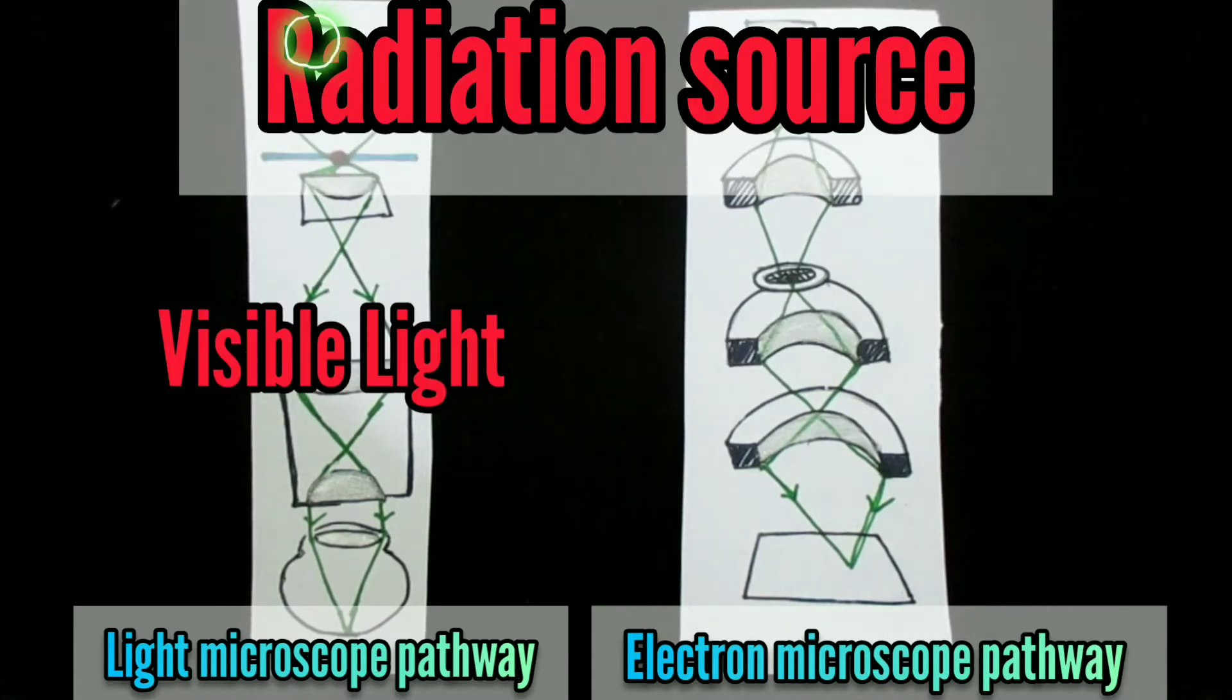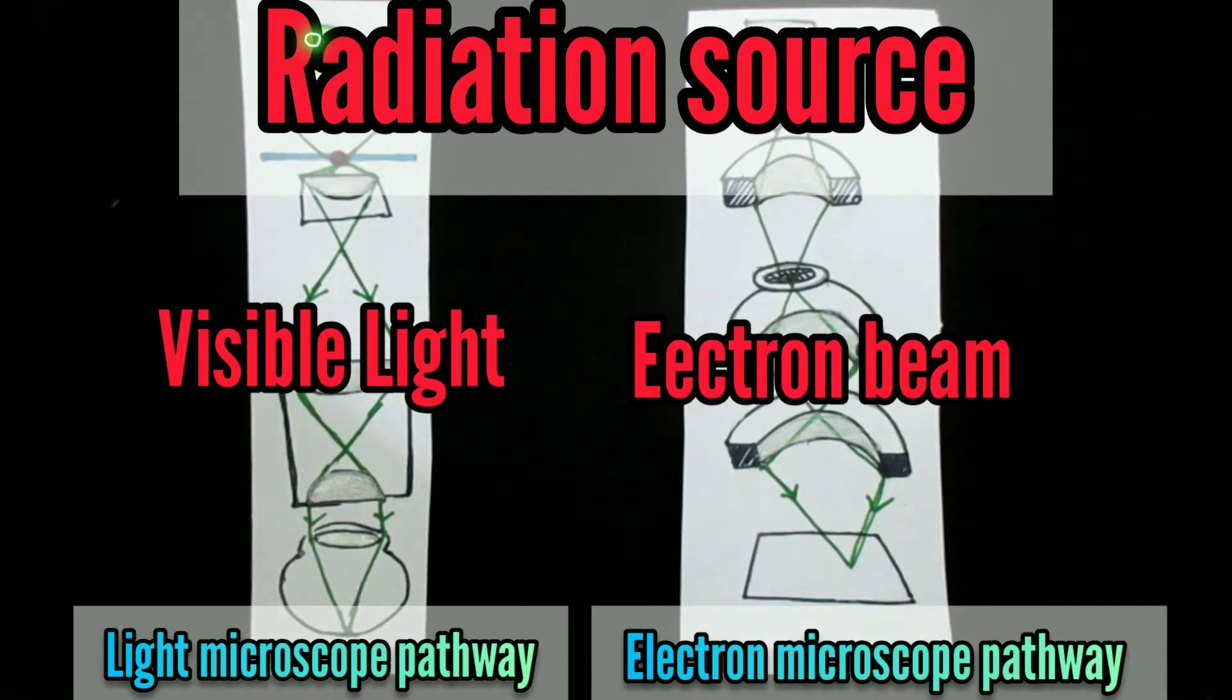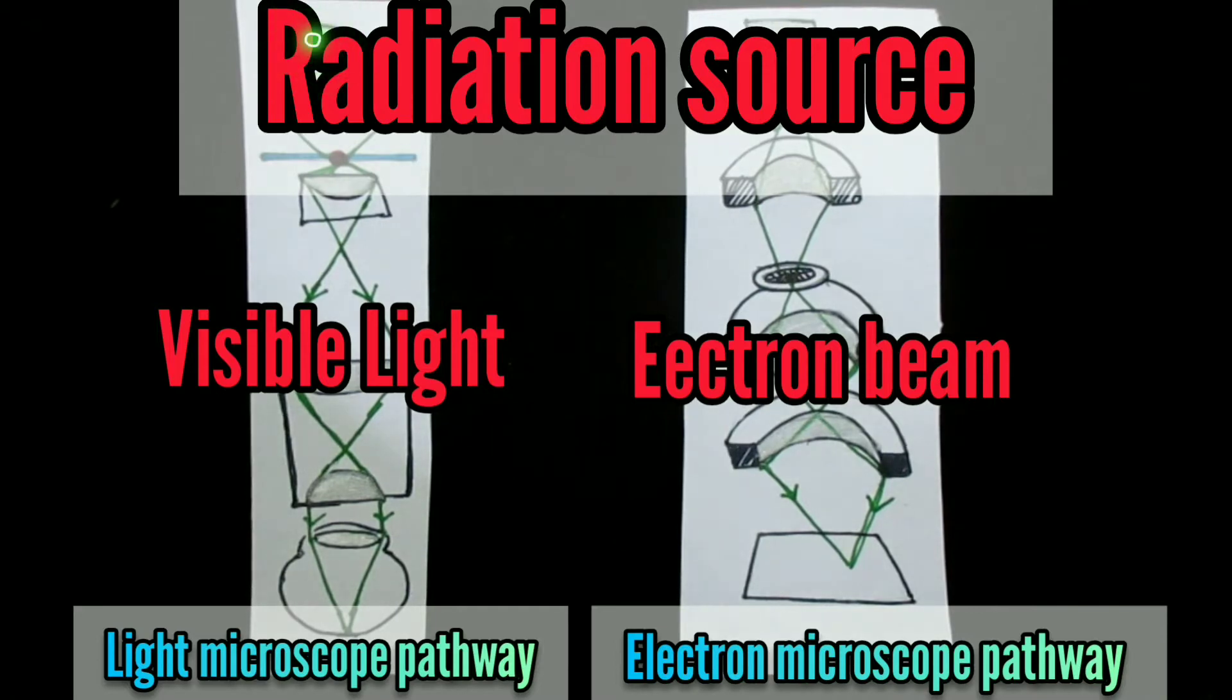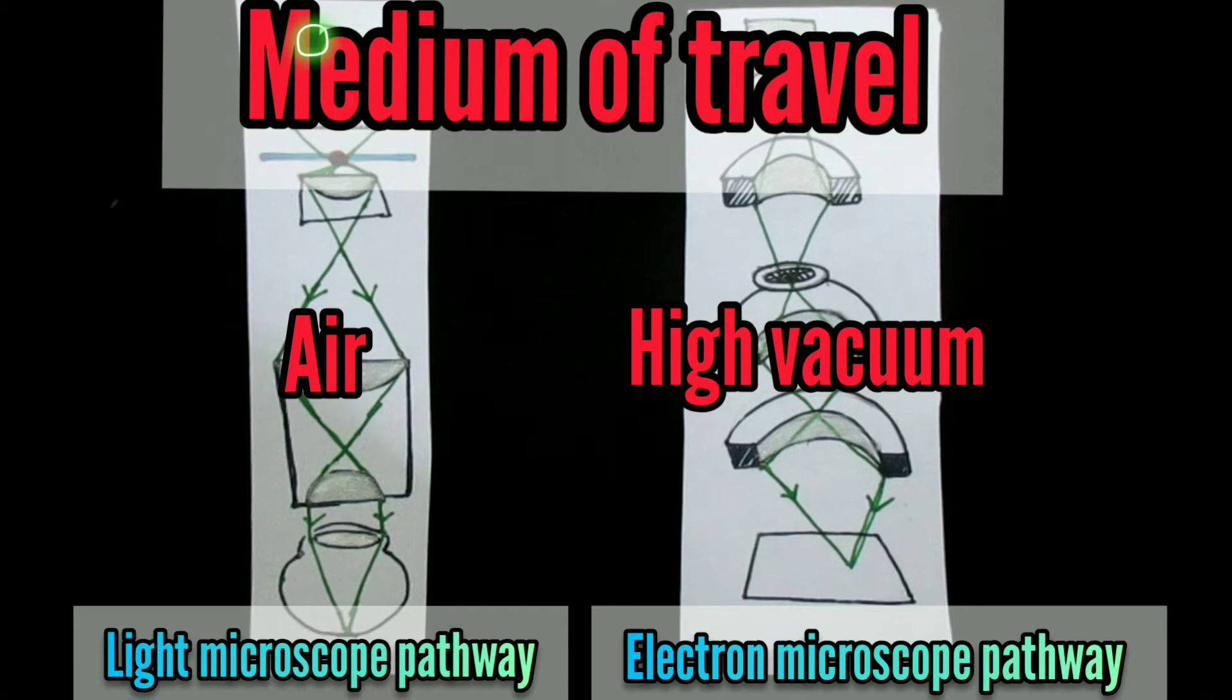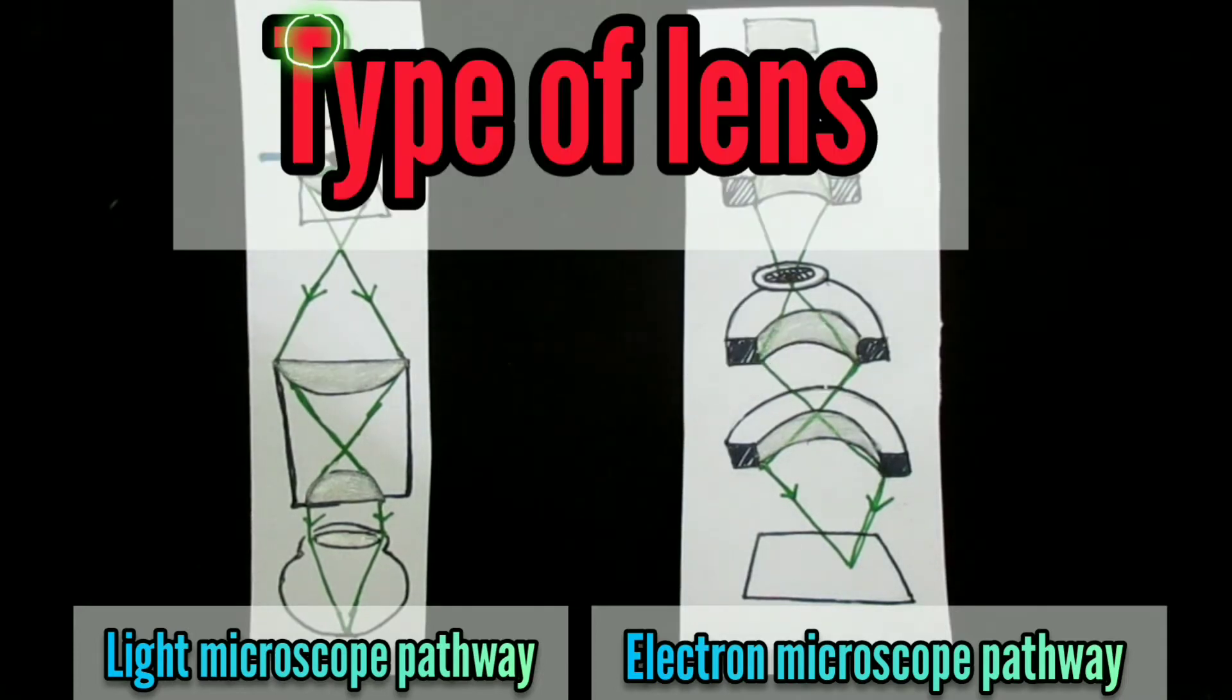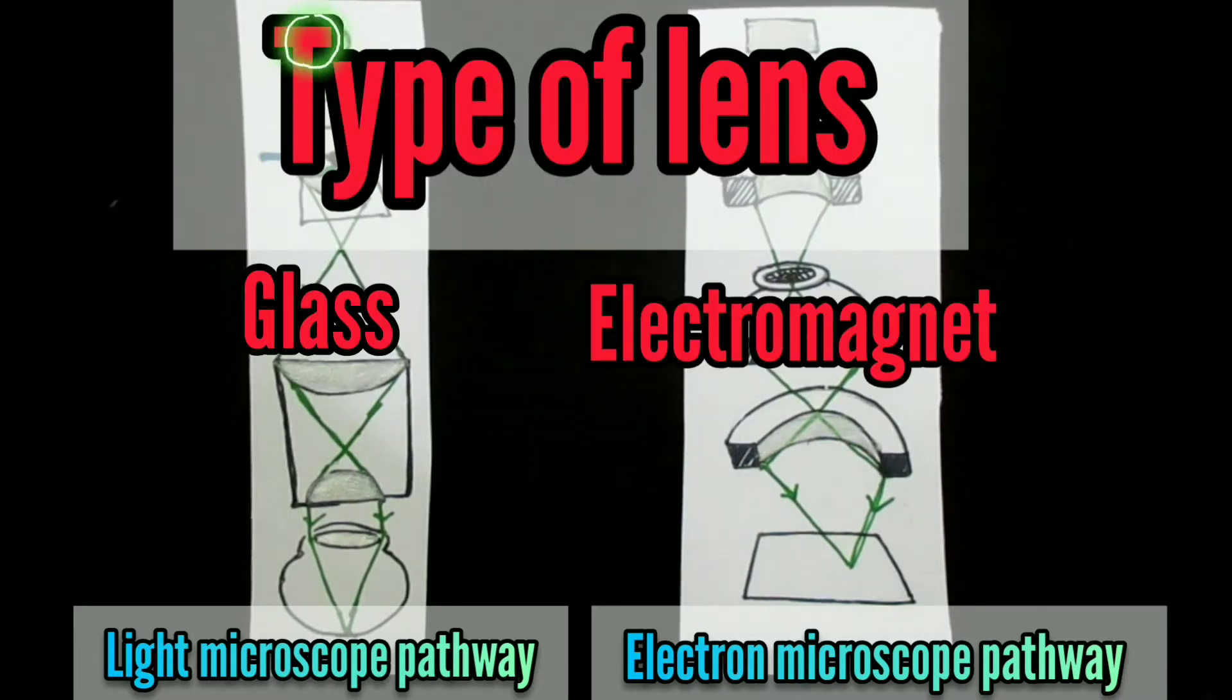The radiation source is visible light in case of light microscope and electron beam is used in electron microscopes. The medium of travel is air in light microscopes and high vacuum is needed for electron microscopes. The lens is glass in case of light microscopes and electromagnets are used in electron microscopes.